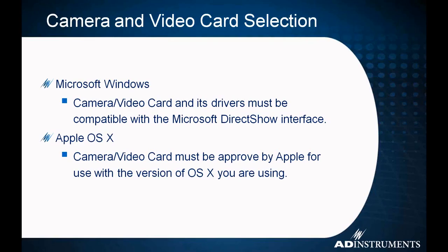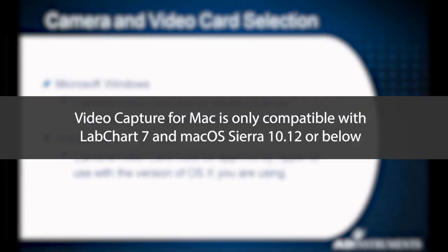Quite often people will buy things from gray market Chinese companies, and they don't always have the best software development, so the drivers for the camera may not work right. They claim they're DirectShow compatible, but their drivers aren't written very well and will have problems bringing the video stream into LabChart.